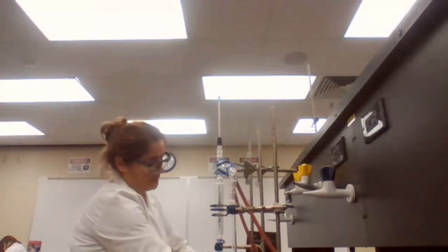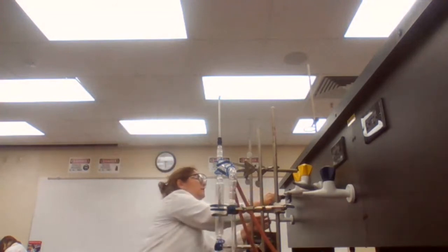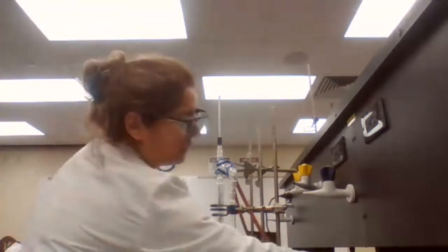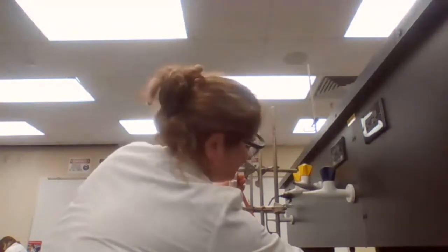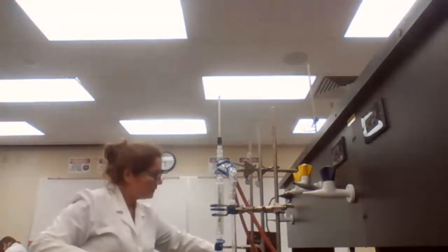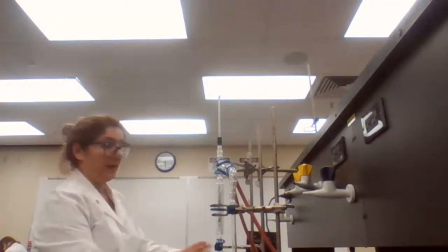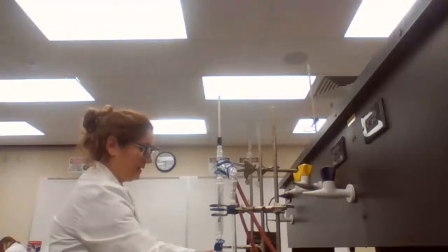Okay, bring up the heating vessel, connect to the power, turn on the water gently, and turn on the heat, and wait. We gotta wait for like 5 minutes.